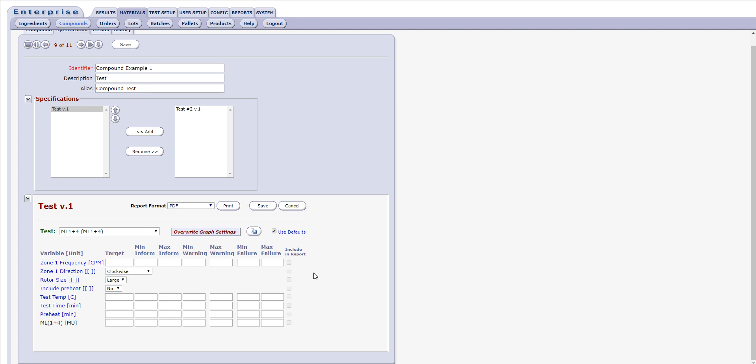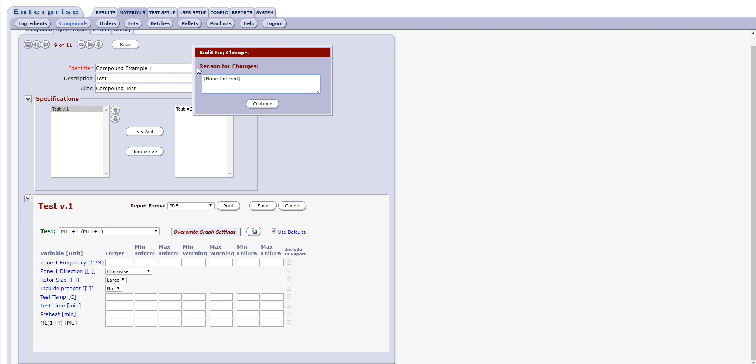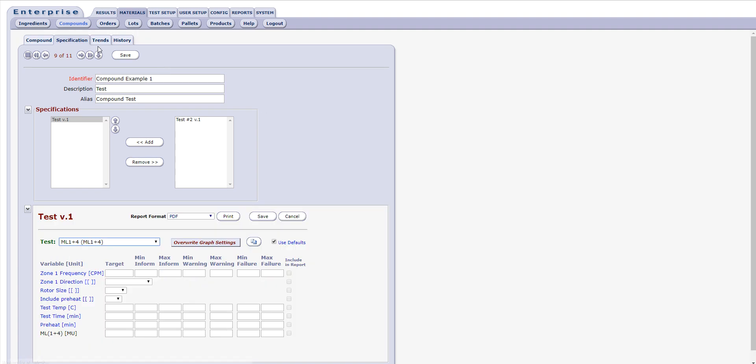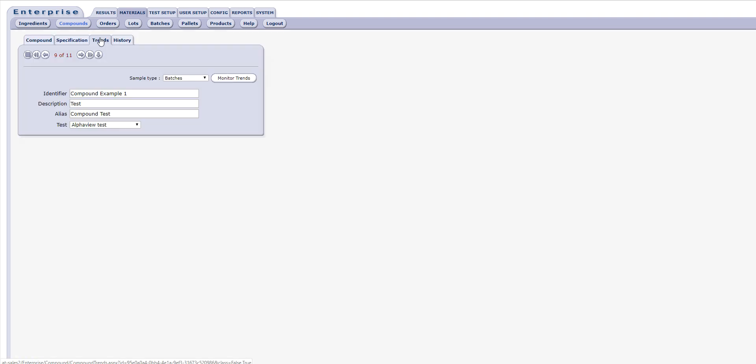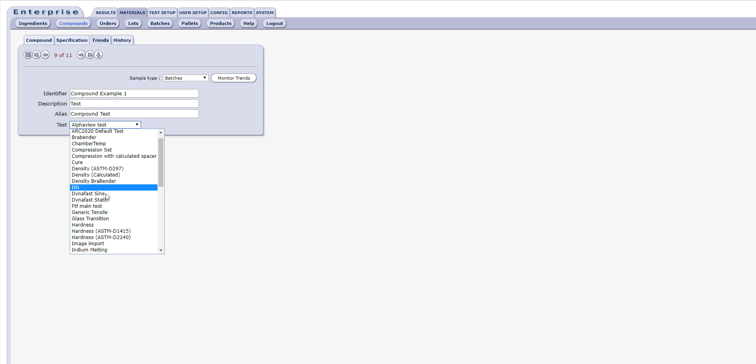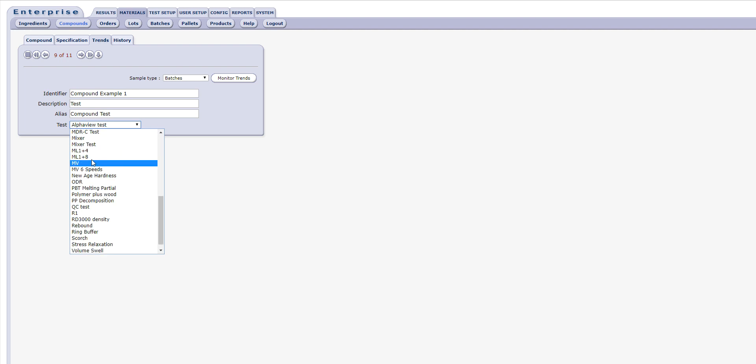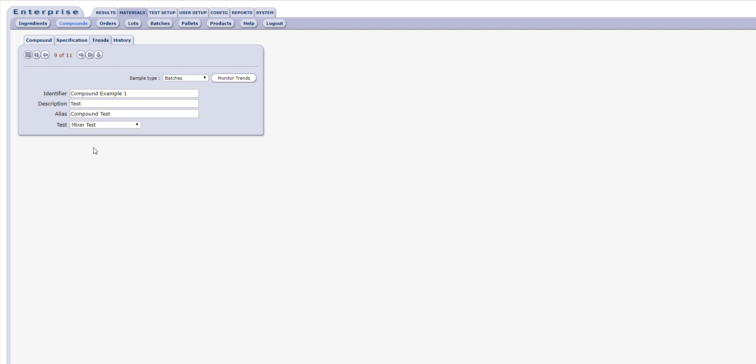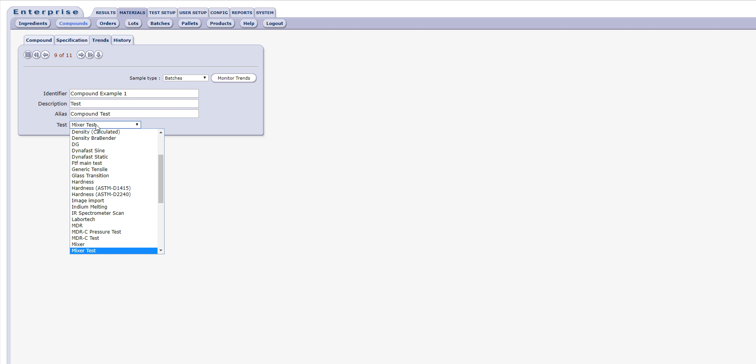The Trends tab is useful for easily monitoring real-time trends on a particular test. The user can select both the sample type via a drop-down menu and the test, also via a drop-down menu, that they wish to monitor for the current compound and click the Monitor Trends button to generate results.